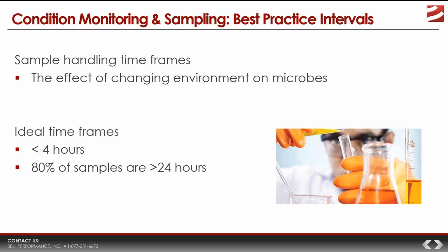The second scenario could be that in the time between when you pulled the sample and when you're getting around to testing it, the microbes actually multiply and grow and increase in number. Now, when we test that, we're going to get 10,000 microbial equivalents, when in fact maybe when we pulled it out there were actually 4,000. Well, that's not ideal.